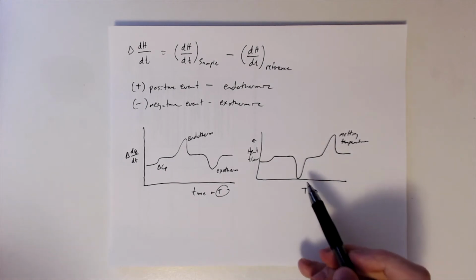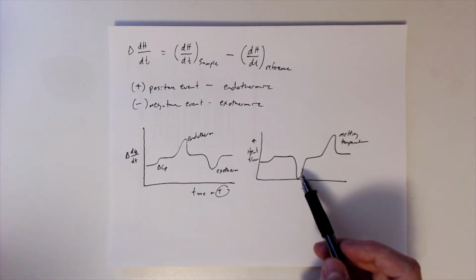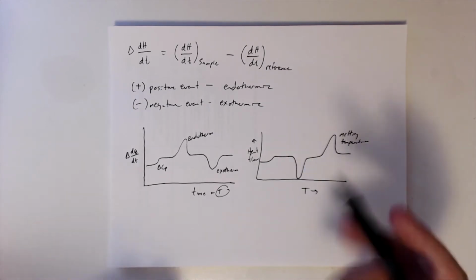All right, so next, this is the opposite. This gives us energy. This puts out energy into the system from the negative peak here. And again, you should ask yourself what kind of event would give off energy, and it doesn't have to be for a polymer, it's actually just any material really. And it happens before the melting. In this case, this is crystallization.